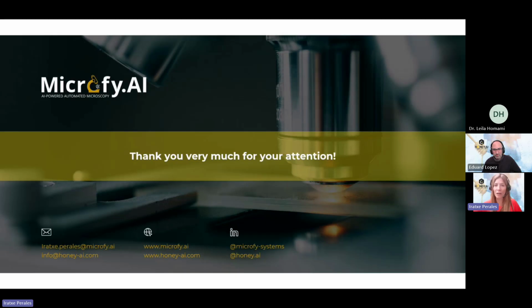Yes, okay. So the fact that you have to choose the monofloral honey is because, for those countries that already have established directives or regulations about the minimum pollen concentration that this honey needs to have, we have included this information in the observations. So when you run an analysis, for instance, for Helianthus, for sunflower, the observations tell you the minimum concentration that you need to have to be labeled. So for you as a user, it's good because you receive the information and then you can check if it's above the value or not.